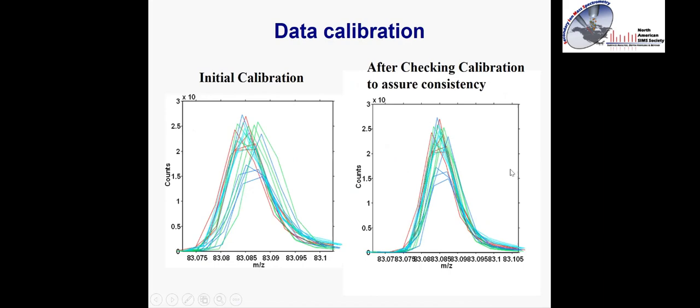Once you have data, it's important to calibrate it properly. All data for a given experiment should be calibrated with the same set of peaks, and you should always check your calibration. Shown here is a series of spectra before and after checking calibration — before, there's quite a shift between peaks that would indicate a second peak. After recalibration, everything overlaps on one single peak. This is important because when we get peak areas, we need to consistently integrate the area from just a single peak before putting it into the analysis.